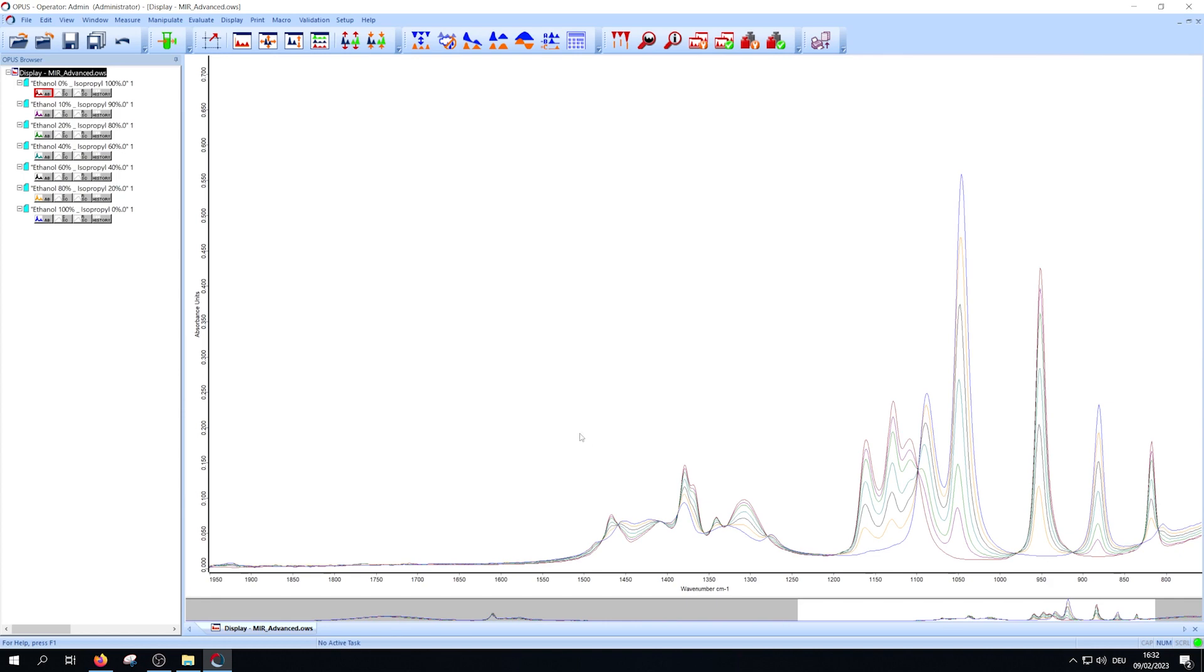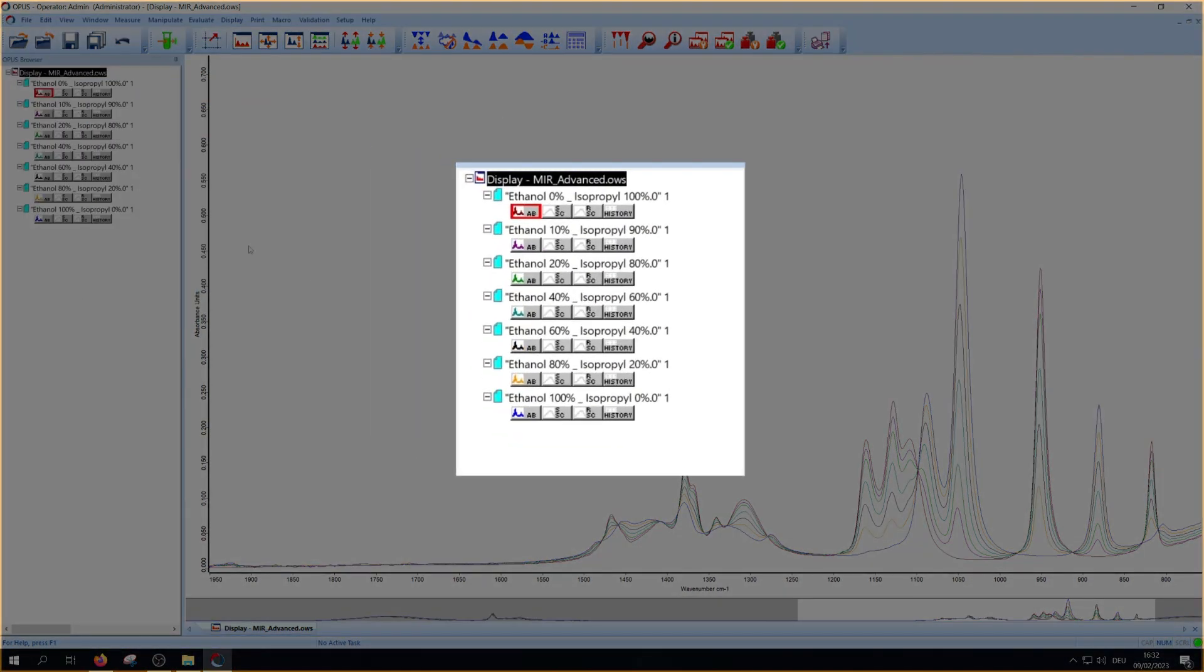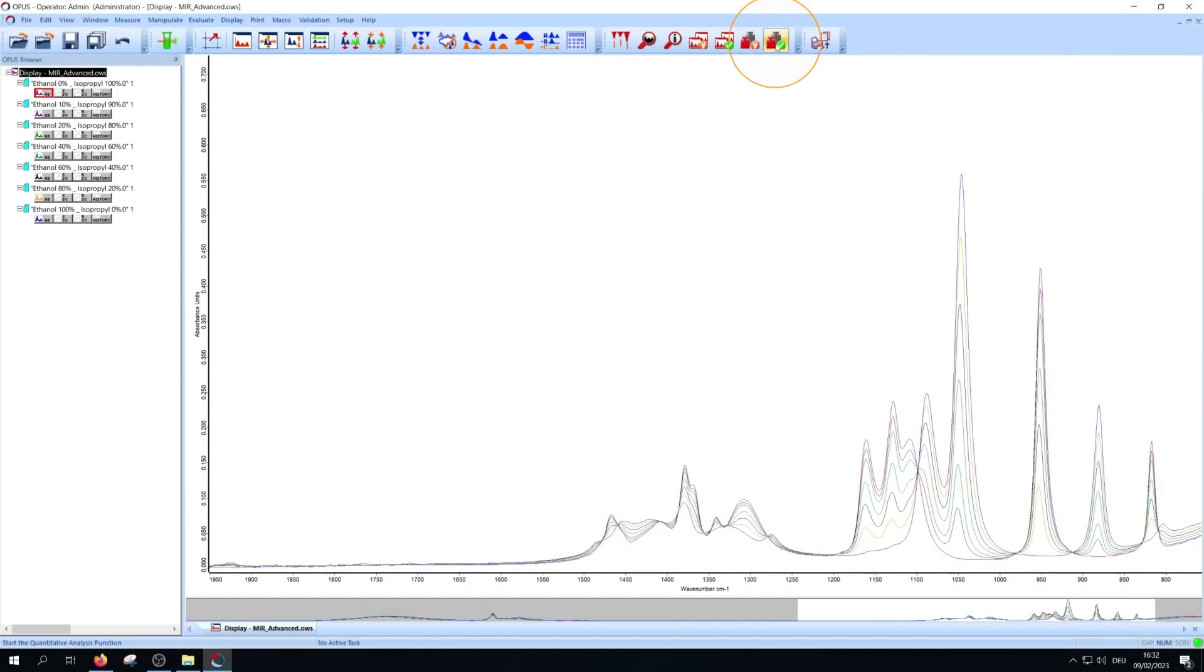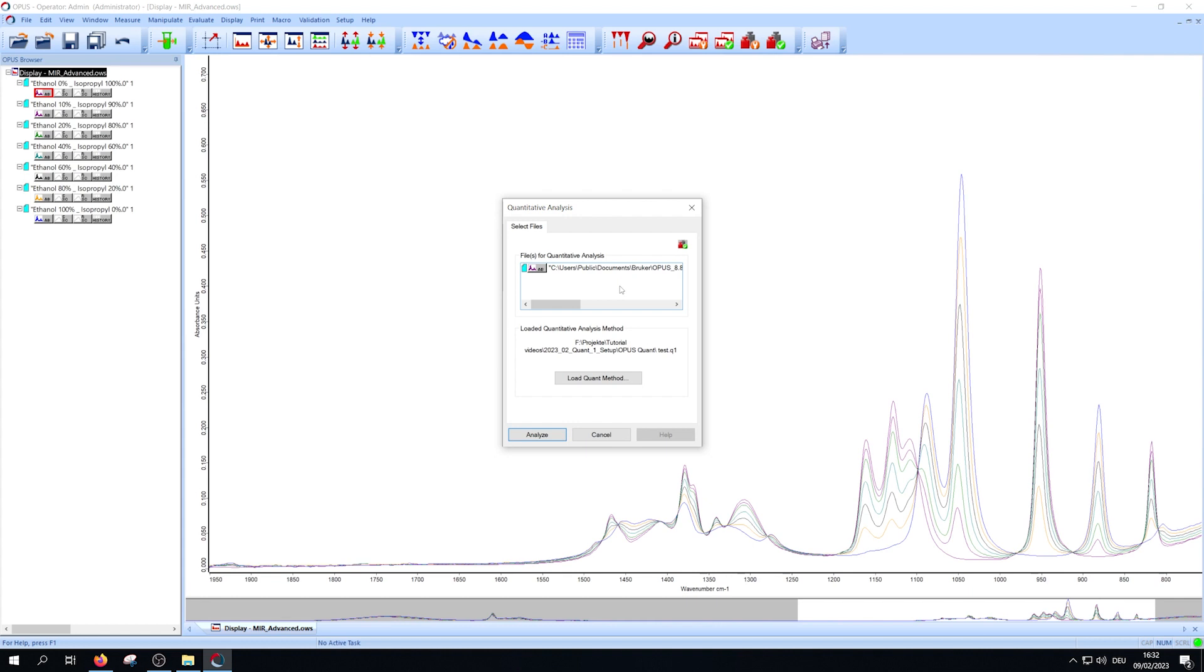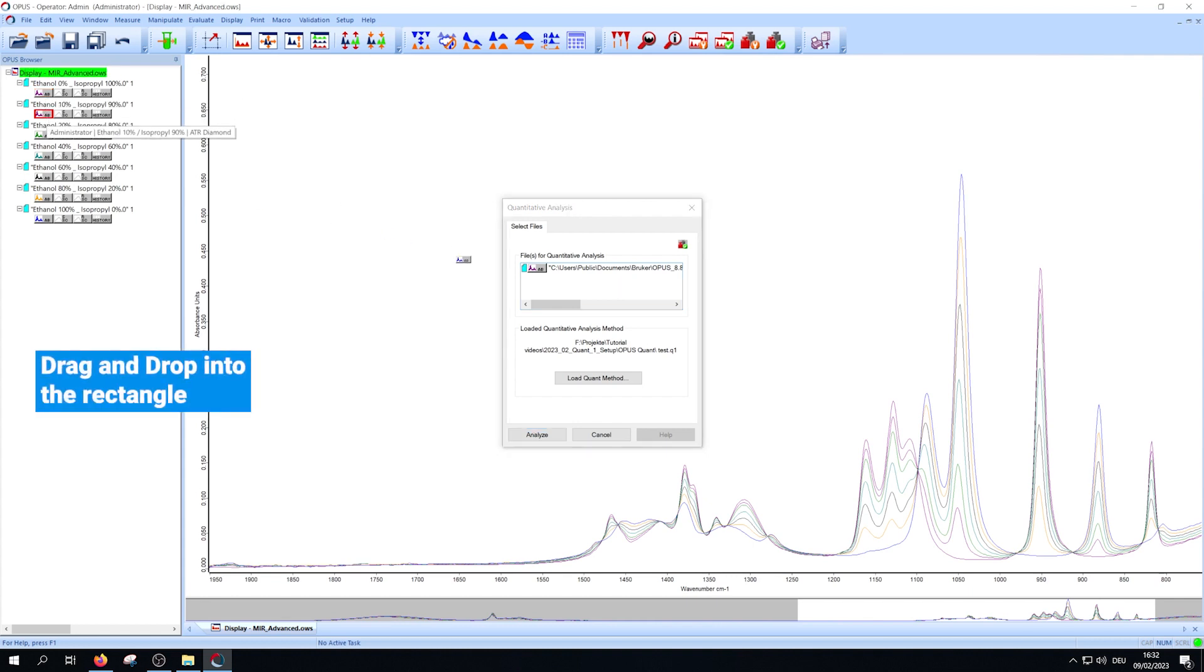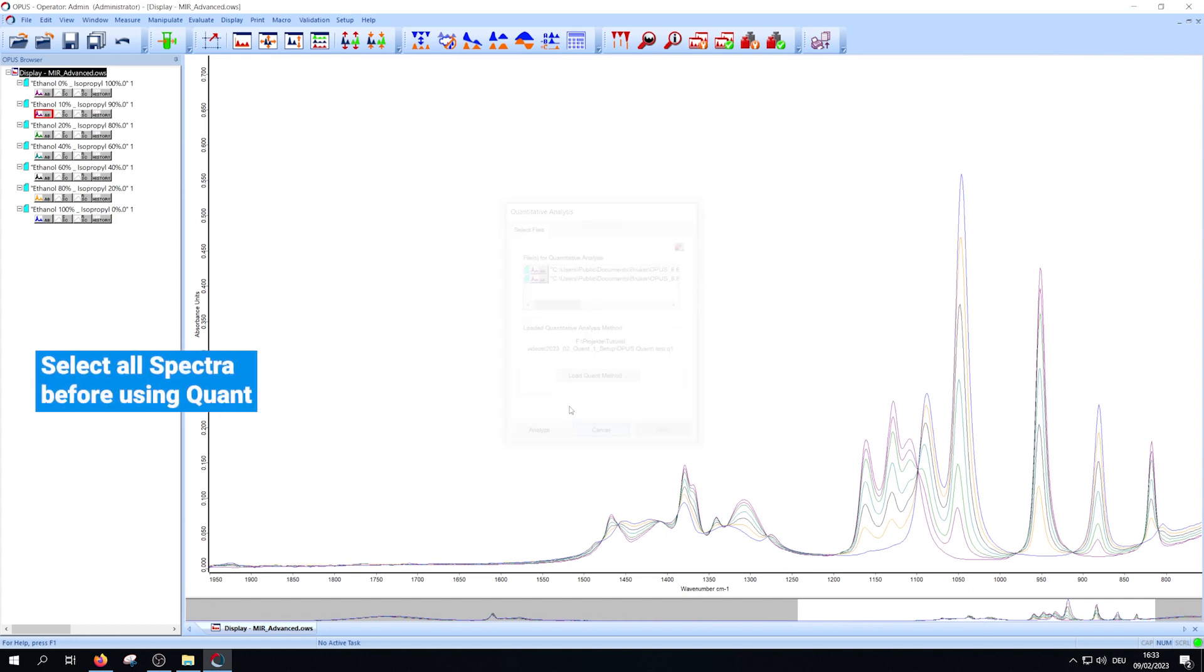To analyze the spectrum select it by clicking on the AB block under the name and press Quant. In the new window you see the selected spectrum. You can add more by moving them into the rectangle. Select all spectra before using Quant.